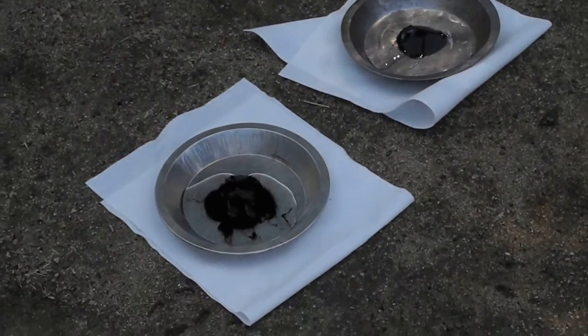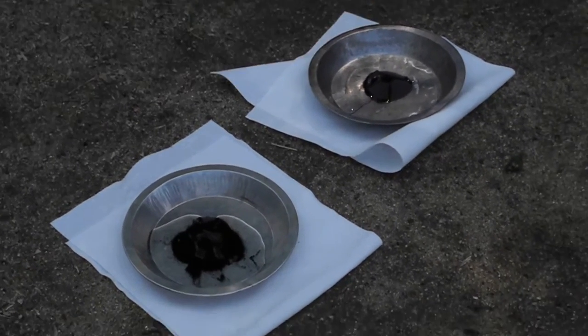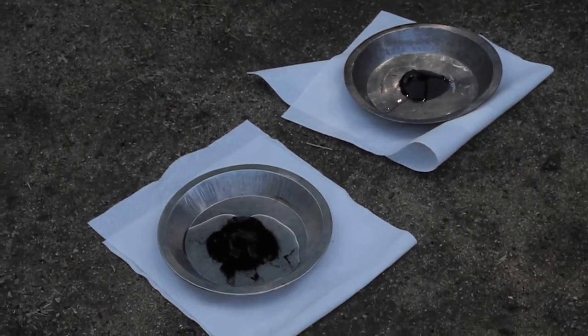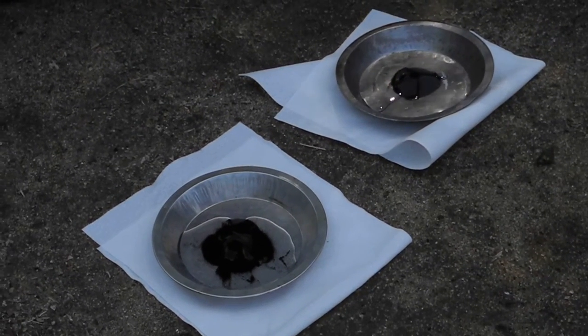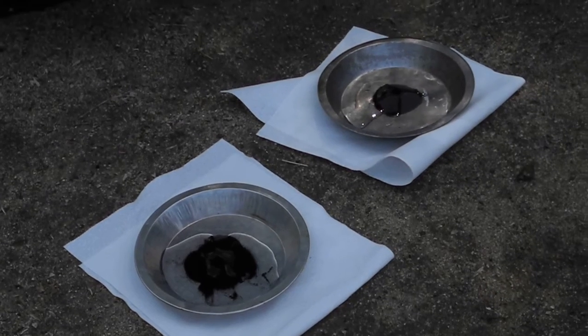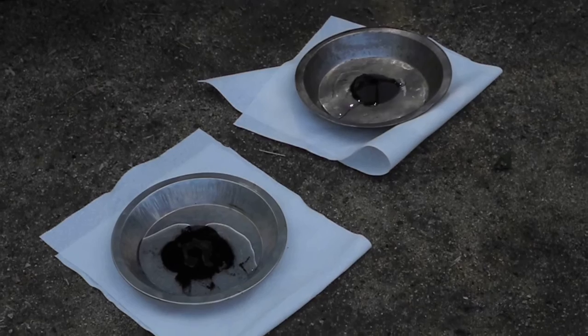Why did you put more on this one? Good question. Yeah, why did we put more on this one? I mean, this one reacts faster. Comparing to which one? I think yours will, because you left a few spots open. You're right, but it doesn't really have any oxygen going to it. I think you should put a bit more on the one that's empty.